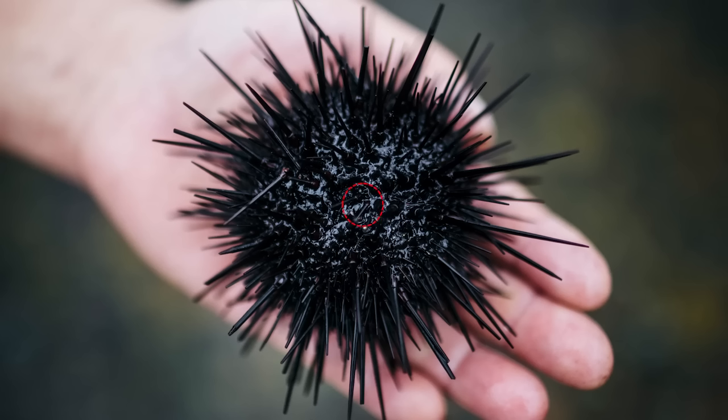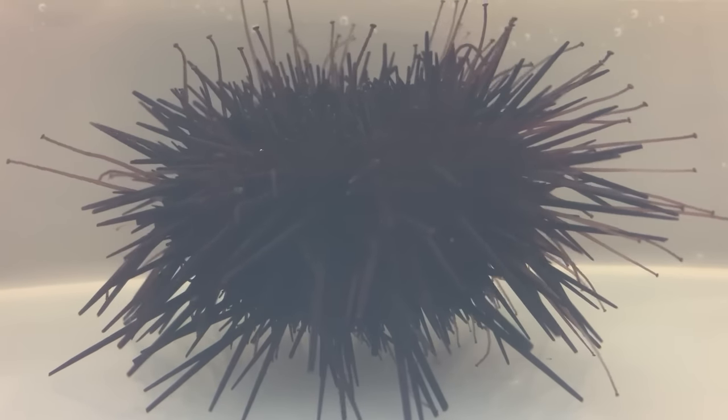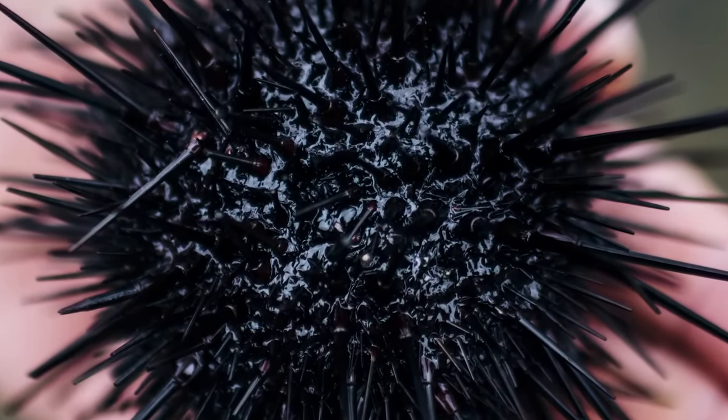Most sea urchins have 5-point radial symmetry in their body structure. However, it is hard to see the exact 5-fold radial symmetry externally, but you can check the 5-radially symmetrical structure by looking at the inside of the sea urchin.